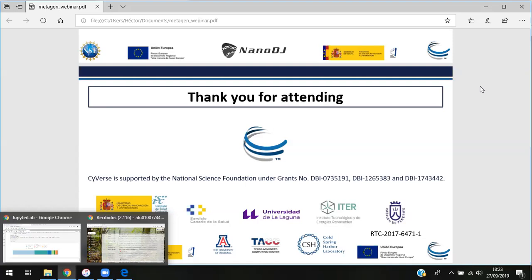We are thinking about updating the base calling section because there is a new software that is being used now. And also, we would like to improve the quality control step and include an option to do that automatically or generate reports with some apps that are already out there. We are evaluating them because there are plenty of quality control tools. And these are the updates that come to my mind right now. Okay, sounds like you've got your work cut out for you.